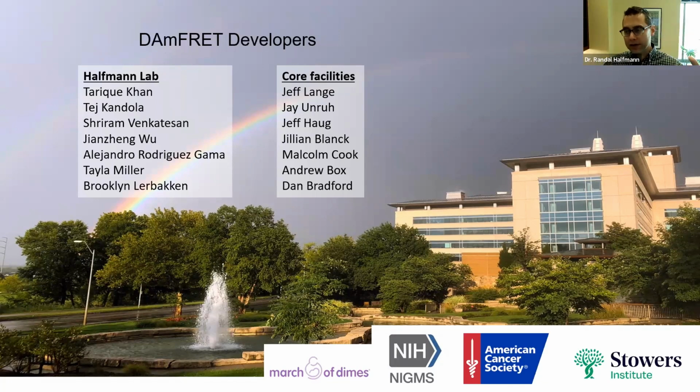If it was low enough concentrations of the protein, STED would allow us to see puncta, and you could potentially look at the brightness of those and distinguish monomer from something else. But at these concentrations, it's double-digit micromolar concentrations where this is happening in the cells. You can't see anything. It's still diffuse. It's bright, but it's still diffuse.